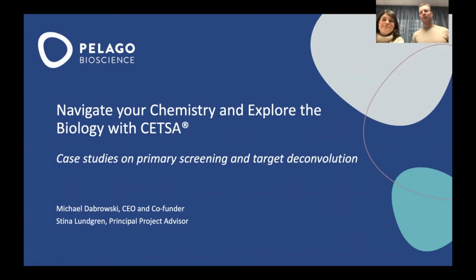And today we're going to talk about how you can navigate your chemistry and explore your biology with the CETSA method. And we're going to illustrate that with some case studies in both primary screening and target deconvolution. I'm going to kick off, and then I'm going to leave the word to Stina afterwards.